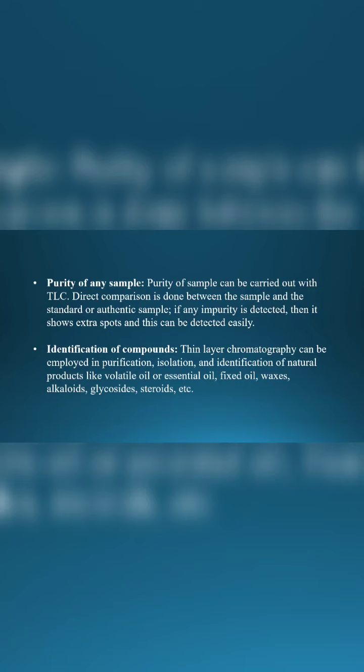To find the purity of any sample. Purity of a sample can be determined with TLC. Direct comparison is done between the sample and the standard or authentic sample. If any impurity is present, it shows extra spots and this can be detected easily.